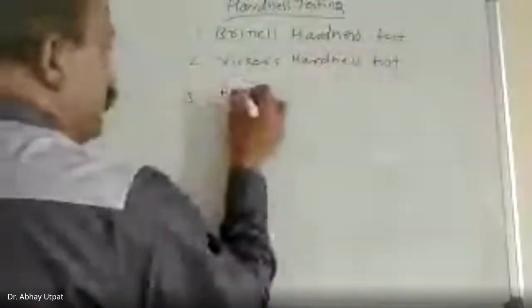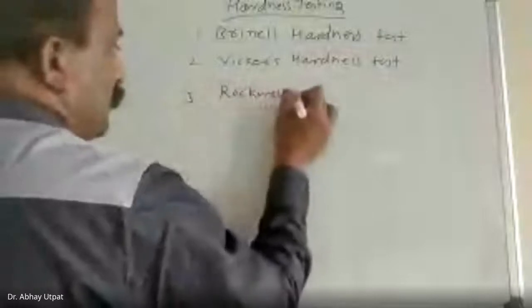Third is the Rockwell hardness test. Same way as you measure length in meters, you are going to measure the hardness.